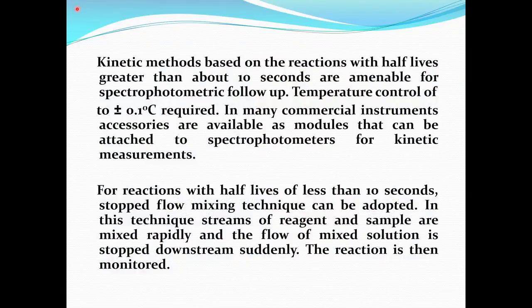So, remember all these things are meant for fast reaction kinetics, and if it is a very slow reaction, there is no problem at all. You can determine every 5 minutes, 10 minutes, if you want to measure the absorbance and determine the concentration, there is absolutely nothing that can stop you from doing so for thousands and thousands of chemical reactions.